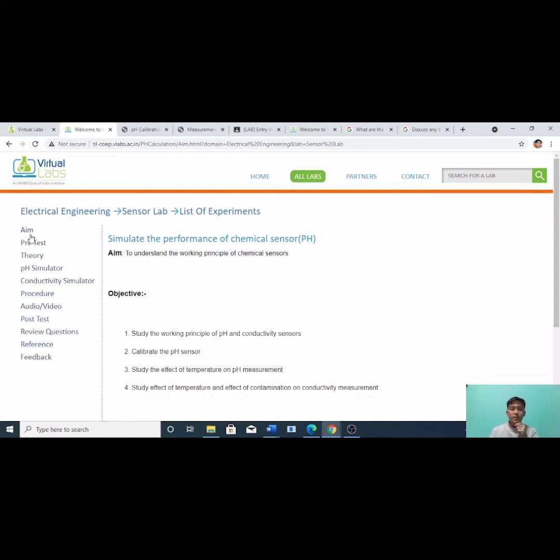For today's video, we're going to discuss the simulation of our chemical sensor pH performance. Our aim is to study the working principle of the chemical sensor. Our objectives are four: study the working principle of pH and conductivity sensor; second, calibrate the pH sensor; third, study the effect of temperature in the pH measurement; and number four, study the effect of temperature and the effect of contamination on conductivity measurement.